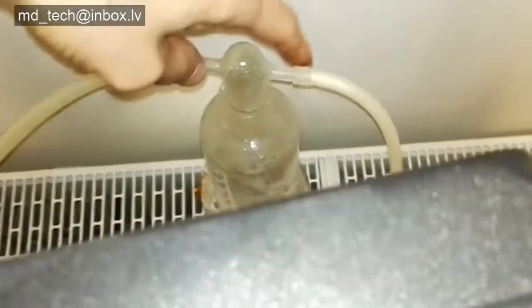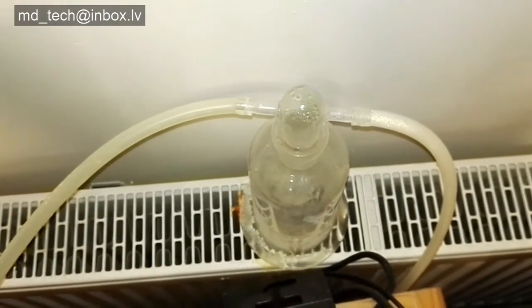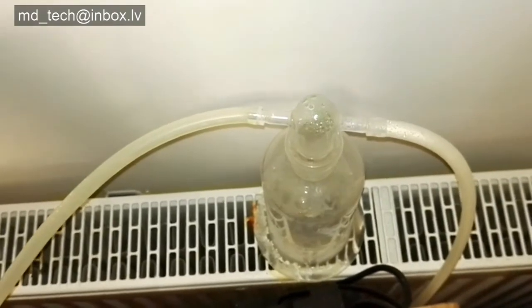This is a gas washer bottle — a bubbler. It contains sodium hydroxide for gas neutralization, or just water to make acid for future works.